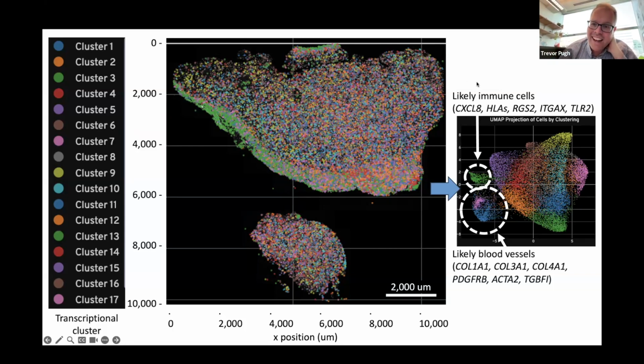They kicked me out. So using just the RNA sequencing data, trying to label the cells within the sample totally independent of spatial. Looking at some of these marker genes, we could say the cells marked in green are likely immune. These cells marked in blue and purple are likely blood vessels. And then this large population are all the cancer cells that are clustering together and are very distinct from the infiltrating immune cells. The problem with this approach is you can see for our fundamental question of where are the stem cells, this is very messy, especially this assignment of the tumor cells.